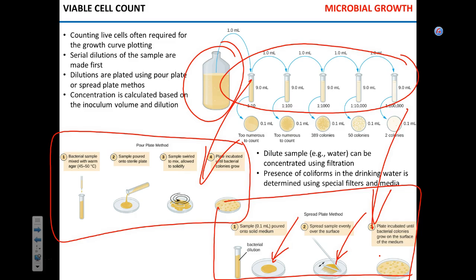If you want to check if there's some bacteria in drinking water, or you want to grab some of the salad greens and see if there are any bacteria from human feces on it. There's not going to be a lot. There are not going to be millions and millions of bacteria, but there are going to be few if you test, I don't know, drinking water or well water. There might be some. So how do you deal with extremely diluted samples?